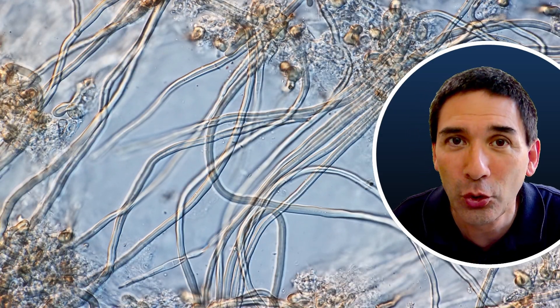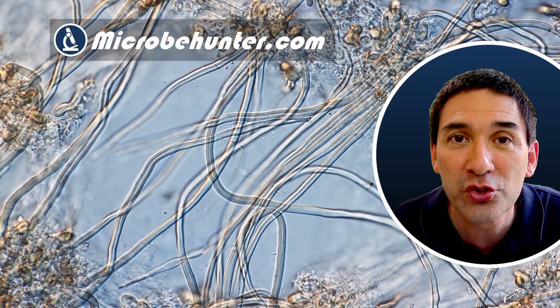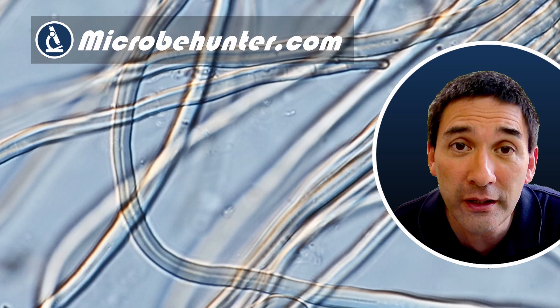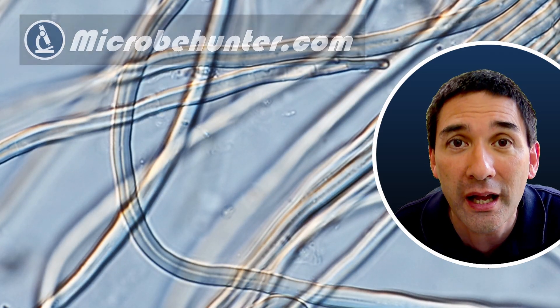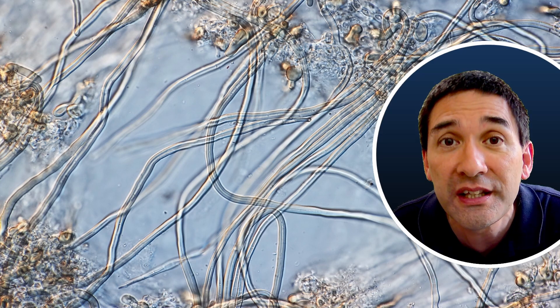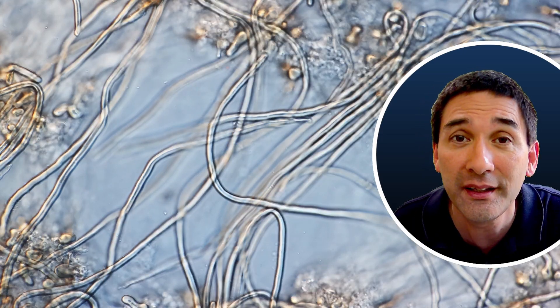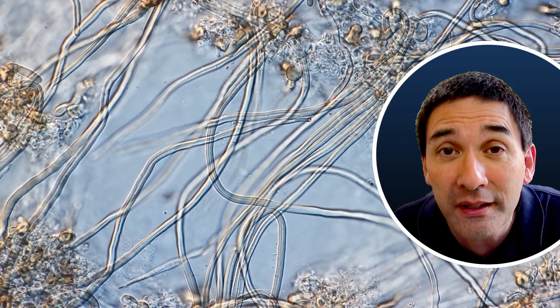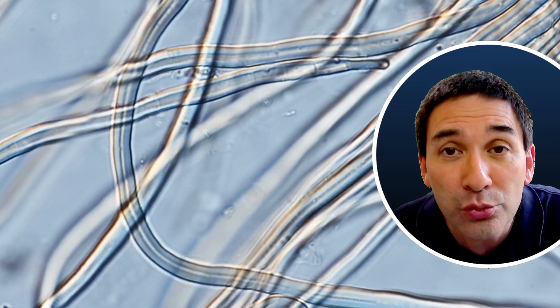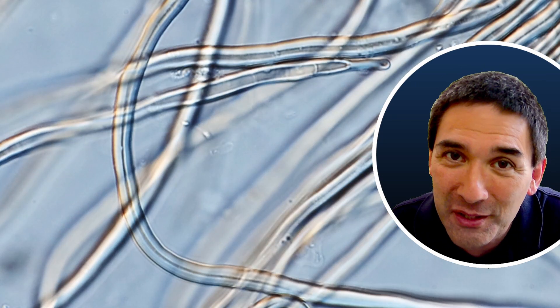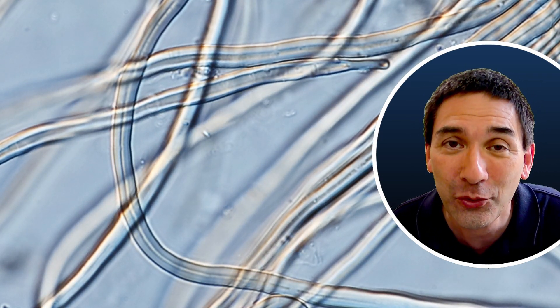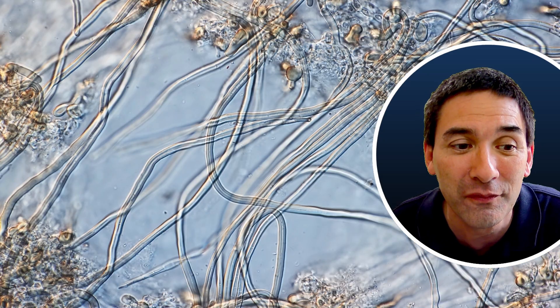This here is now a fungus under the microscope and those long structures are called the hyphae of the fungus. And those hyphae look a little bit different from what I expected to find. As a matter of fact, I was not able to see the individual cells, and in that sense, those aseptate fungi as it's called seem to defy the cell theory a little bit. And this is what the video is about. I would like to show you some special cases of the cell theory, and those fungi are a very good example of this.